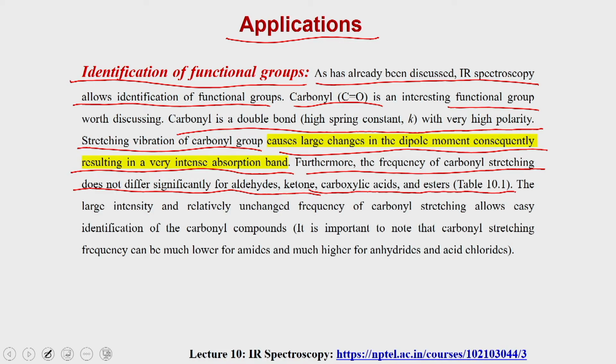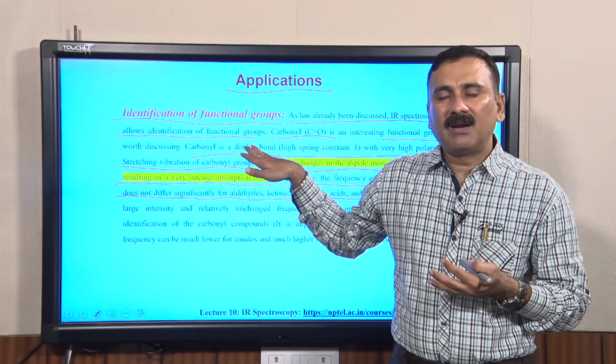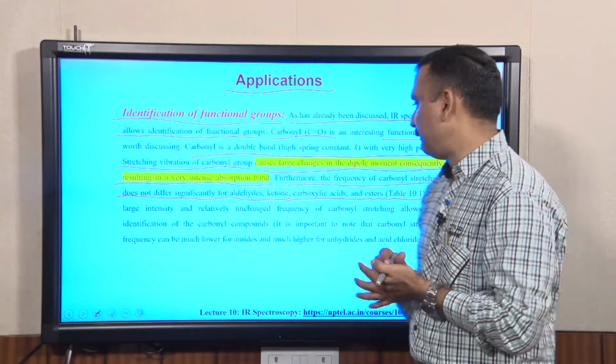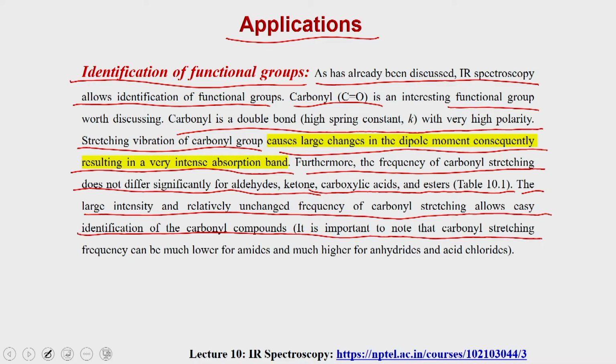As we discussed in the past, if you have some functional groups and some other groups nearby, that may change the vibrations. But the carbonyl bond is very strong, and that is why it does not get affected by the nearby groups. The large intensity and the relatively unchanged frequency of carbonyl stretching allow easy identification of carbonyl compounds.